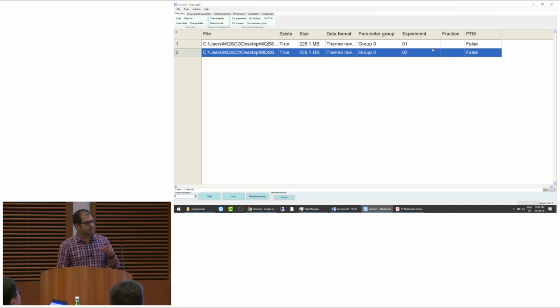For the 5 phospho-enriched files, you will set that to true, because then it knows that this is phospho-enriched and that is the proteome file, and this information is used to calculate occupancies. For example, if we have 100 molecules of the protein, how many of these protein molecules are actually phosphorylated? These occupancy calculations need this information. To really search for phospho, this doesn't matter because you will set the modification in the next tab.